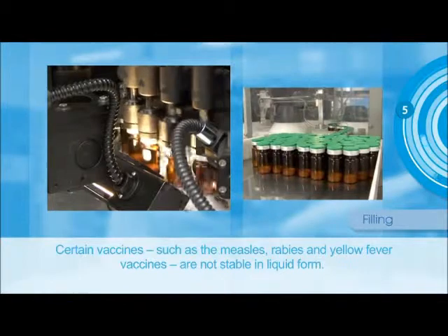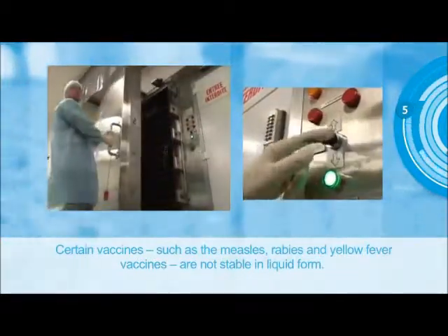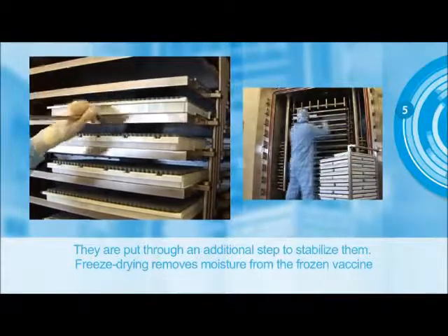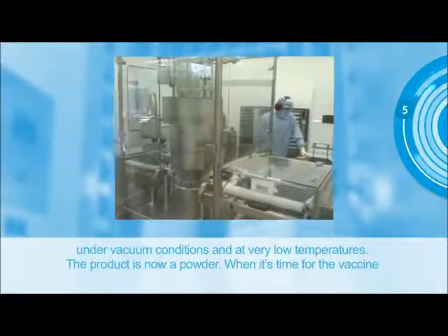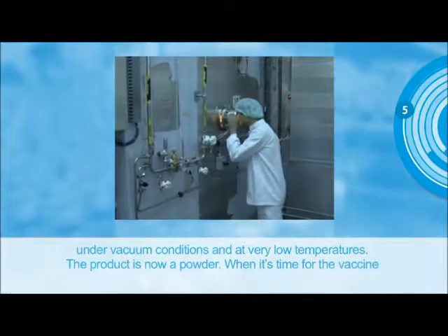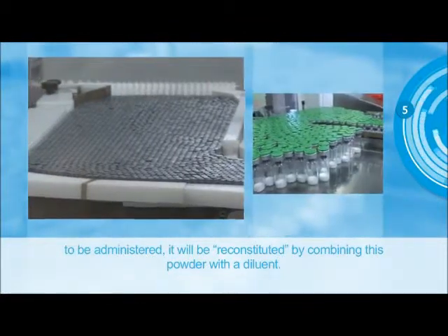Certain vaccines, such as the measles, rabies, and yellow fever vaccines, are not stable in liquid form. They are put through an additional step to stabilize them. Freeze-drying removes moisture from the frozen vaccine under vacuum conditions and at very low temperatures. The product is now a powder. When it's time for the vaccine to be administered, it will be reconstituted by combining this powder with a diluent.